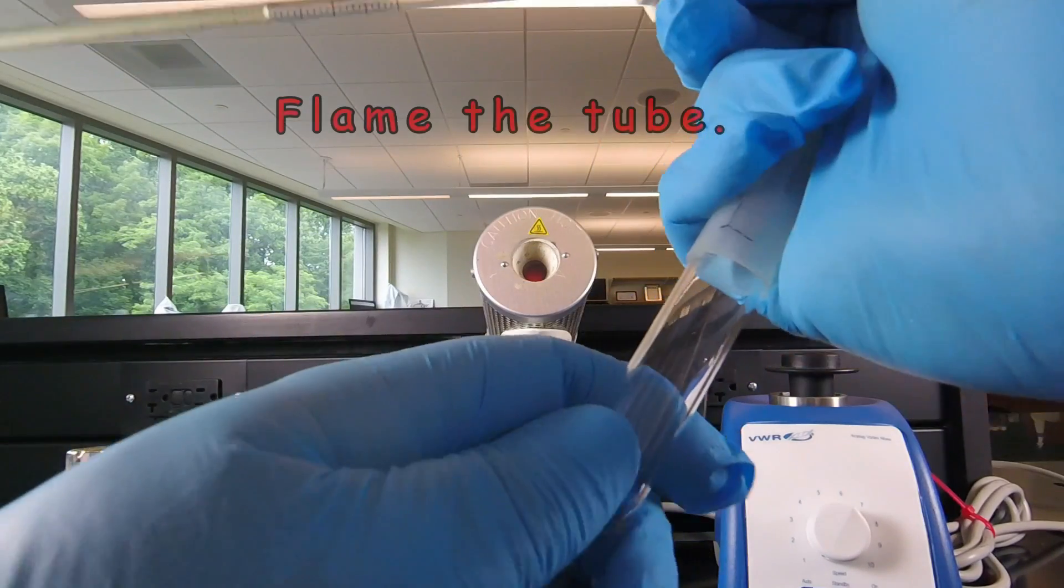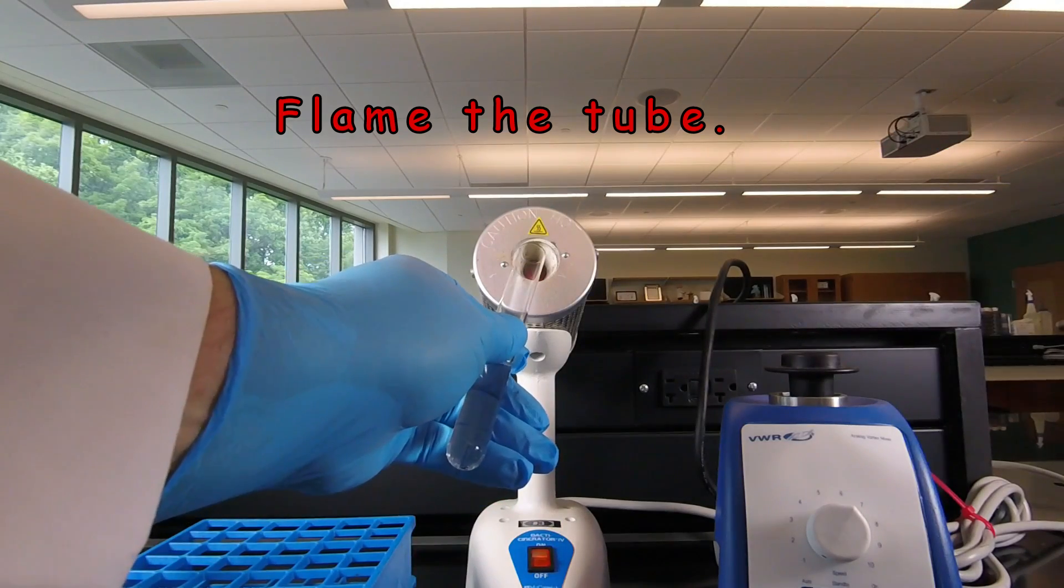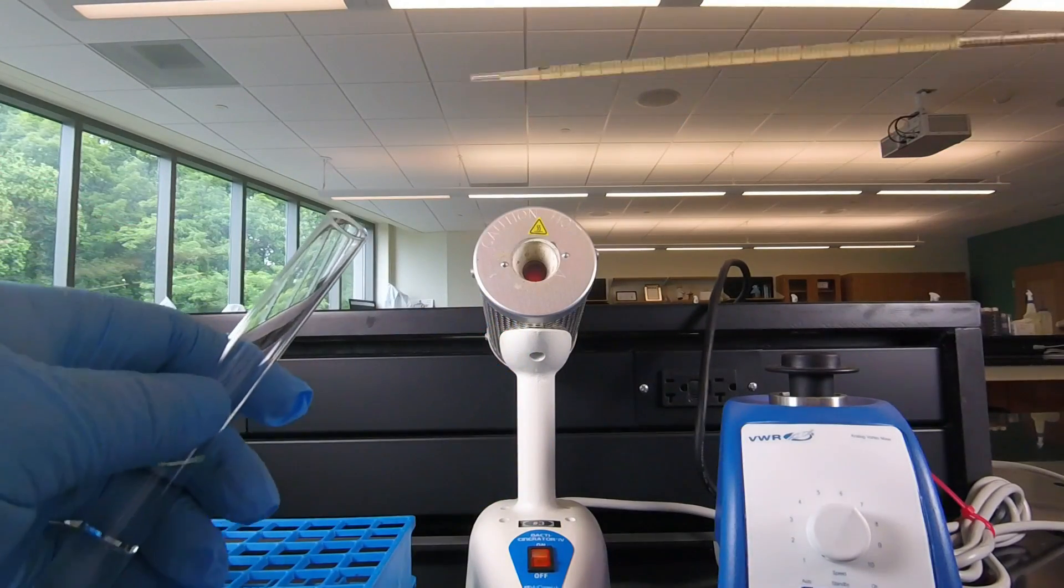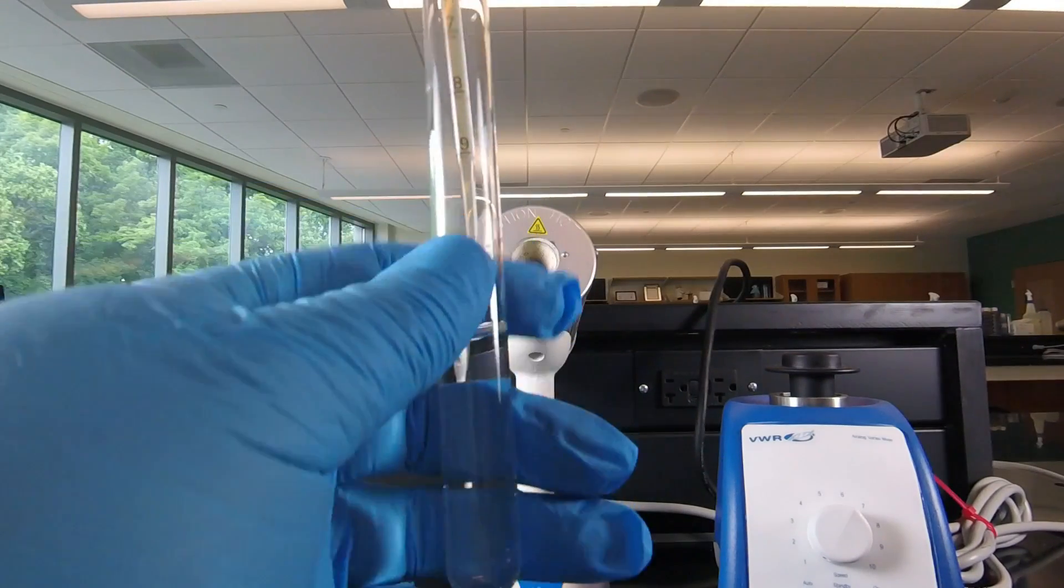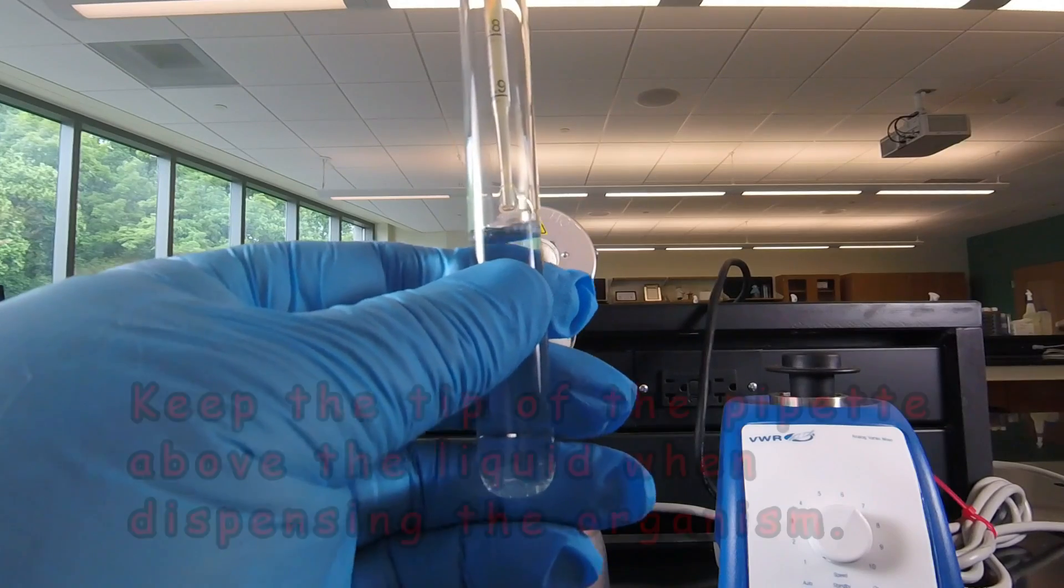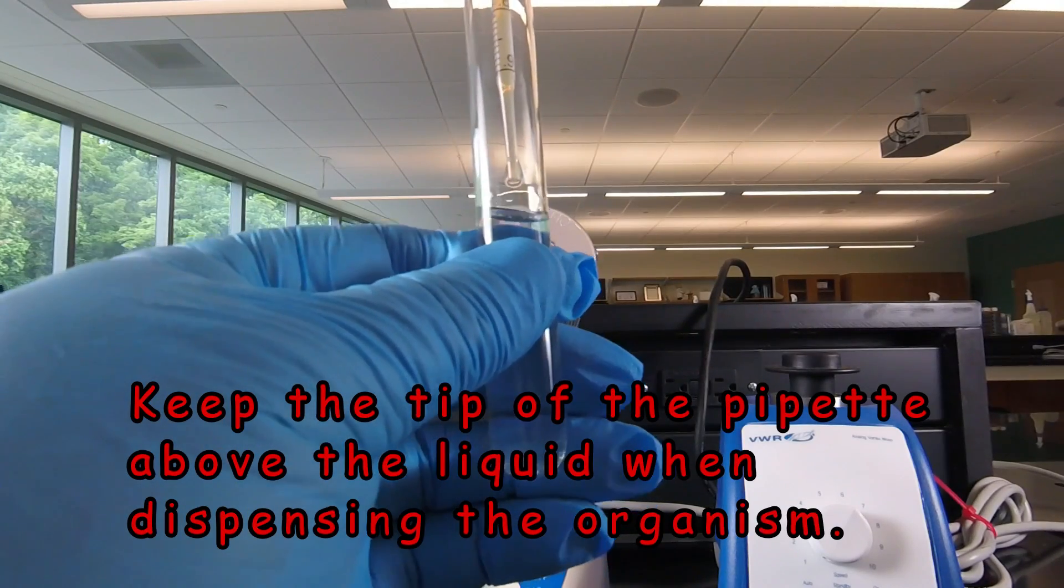So again you would remove the cap of the tube, you're going to dispense the bacteria in, flame the tube, then we put the tip of the pipet in the tube. And in this case now we want to be able to see the bottom of the pipet when we're dispensing.